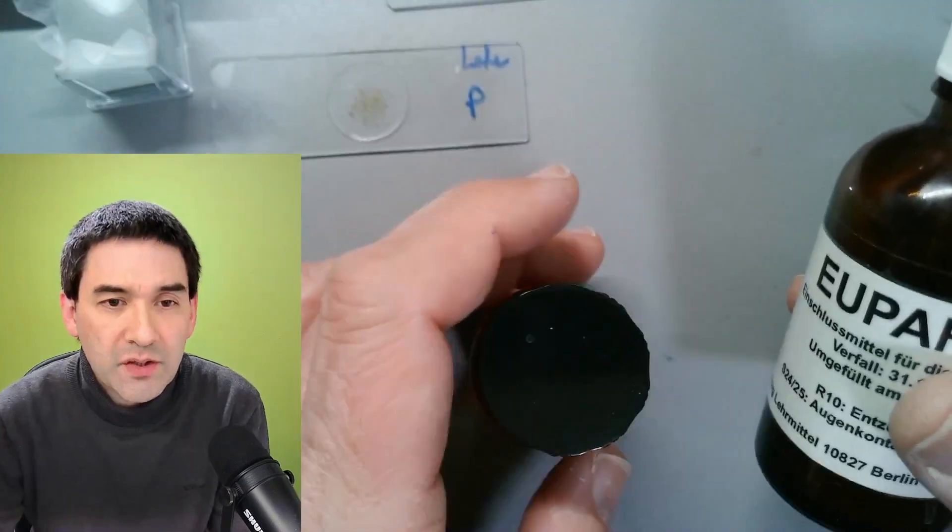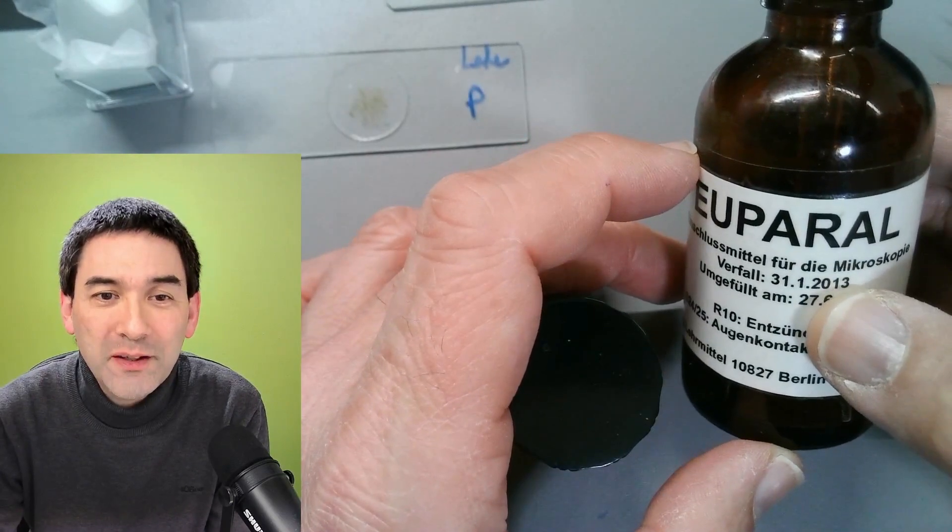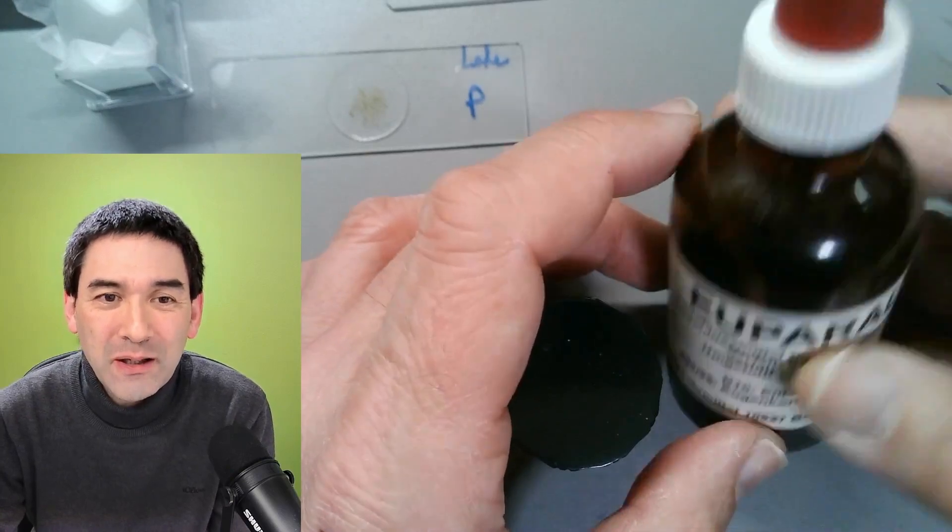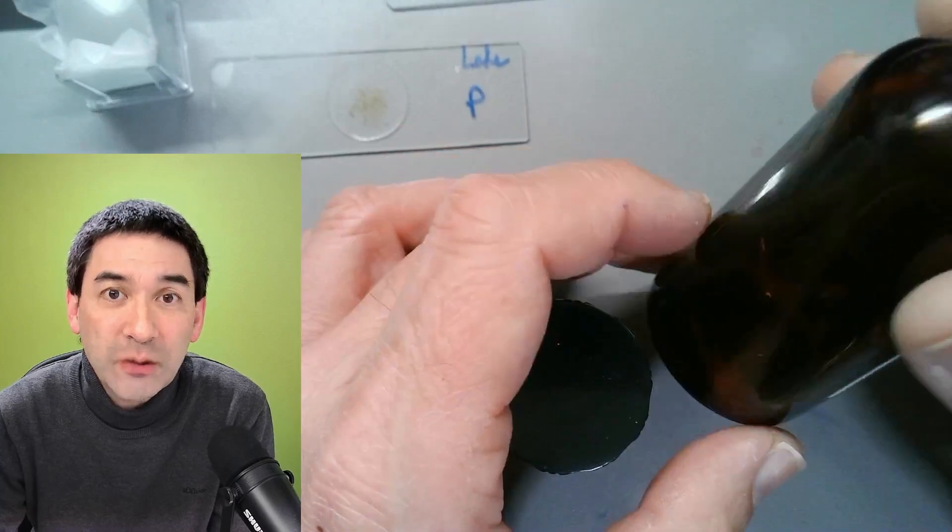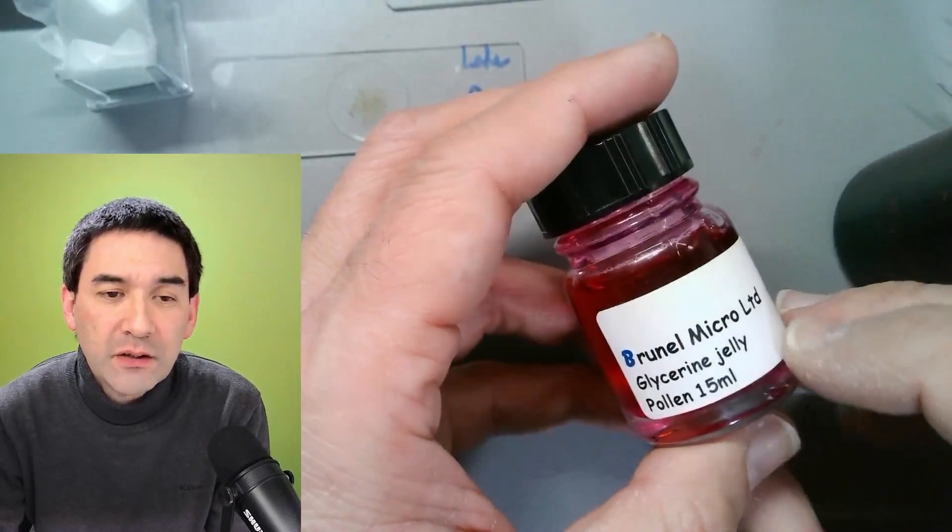Here, this is Euparal, right? It's already expired back in 2013, but it's still usable. You see that it's a little bit—I can dilute it with a little bit of alcohol. And this one over here, that is glycerin gelatin.